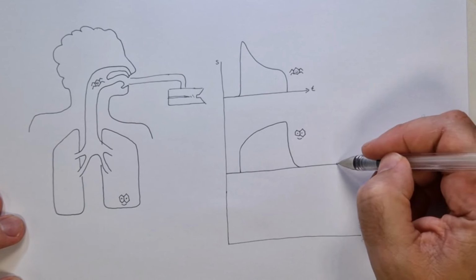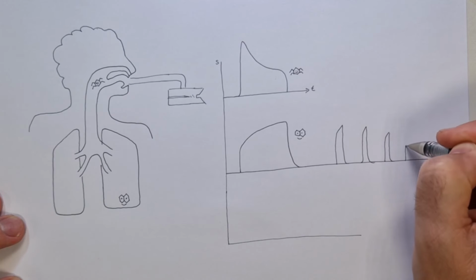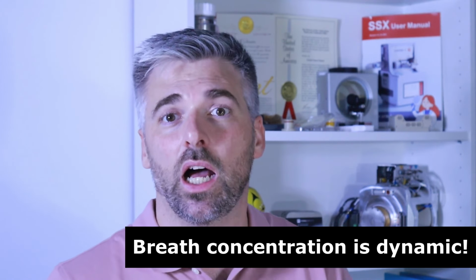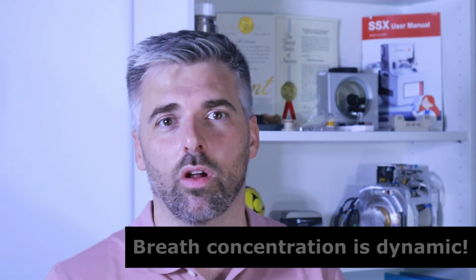And if you do multiple exhalations in a row, you'll see some signals climb or fall between breaths. The composition of breath is very dynamic. The study of how the composition of breath changes over time can be fascinating. You could study how aromas are released in the mouth and the nasal cavity and how they are perceived. This is relevant for the food and aroma industry. You could also study how inhaled substances behave in the lungs. For instance, we can track the washout profile of nicotine and other tobacco-related metabolites.